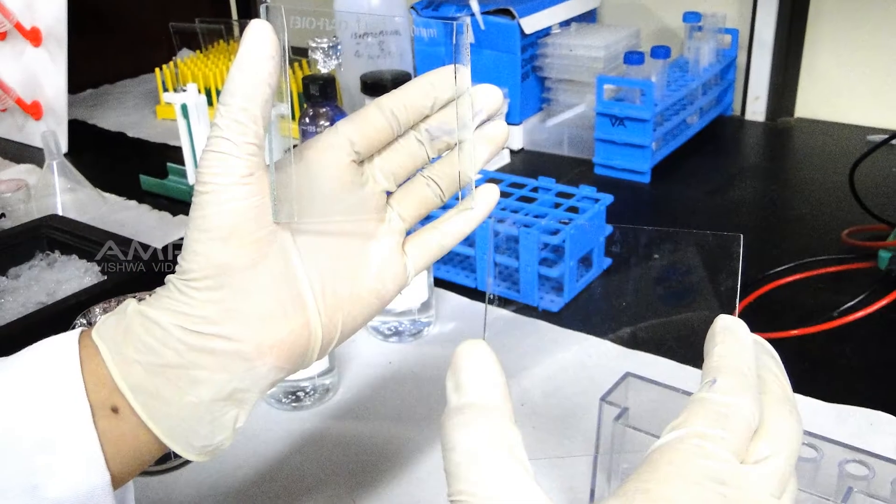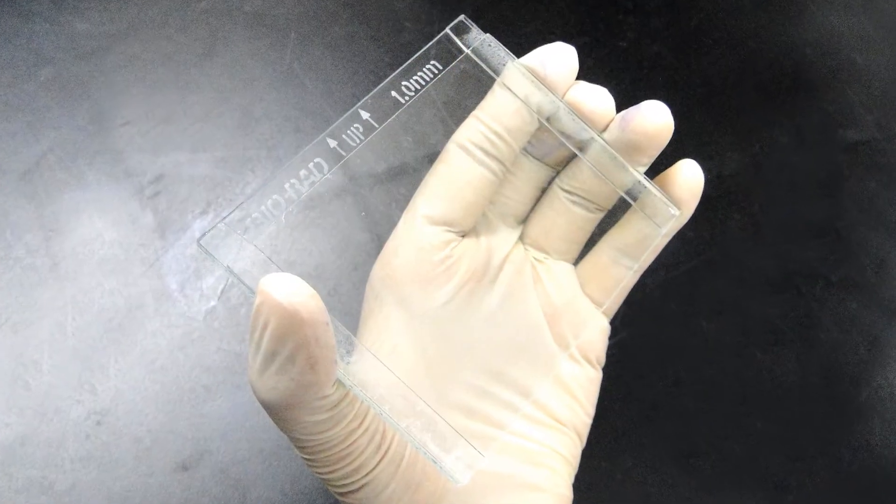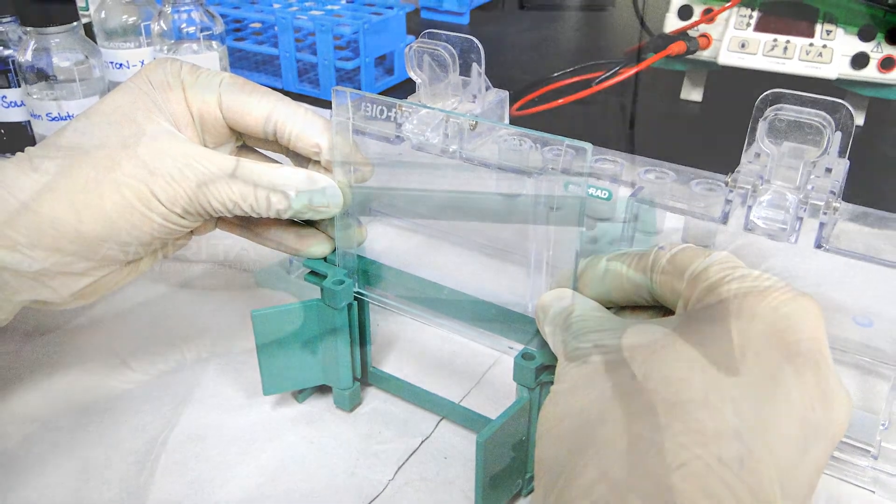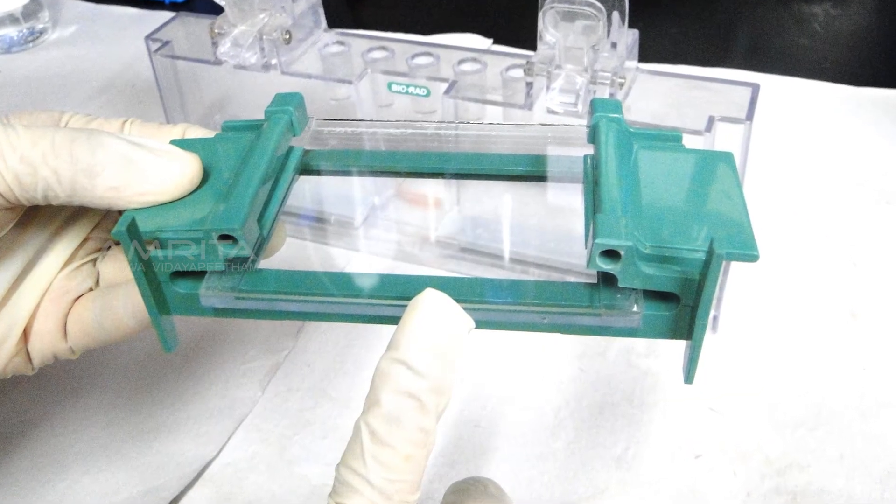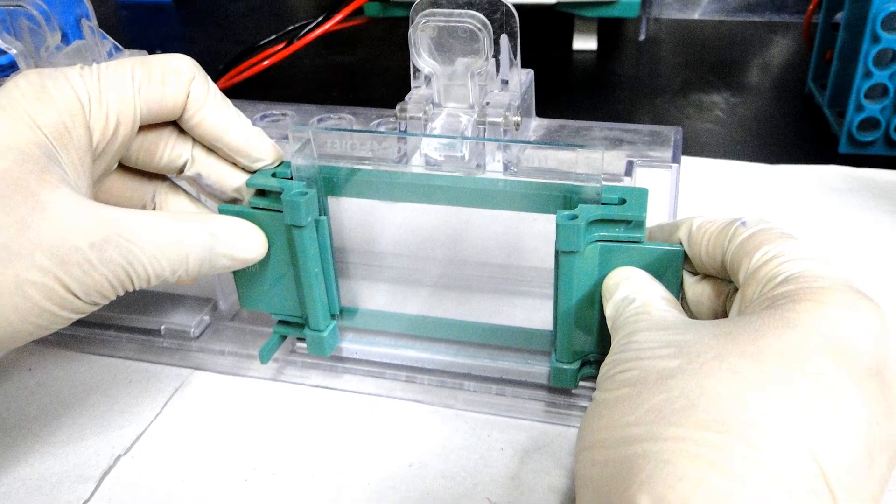Procedure: Assemble the glass plates on a clean surface. Lay the longer glass plate down first and then place a shorter glass plate on top of it. Embed them into the casting frame and clamp them properly. Make sure that the bottom ends of the glass plates are properly aligned. Place the casting frame onto the casting stand.